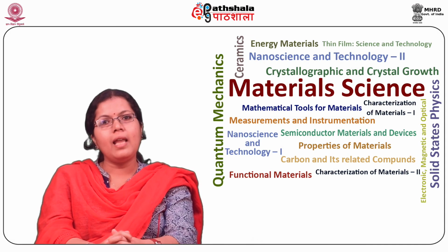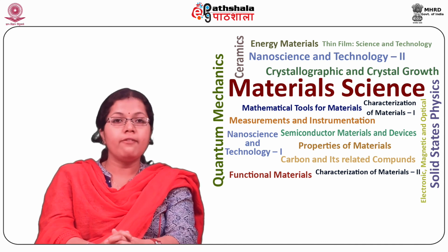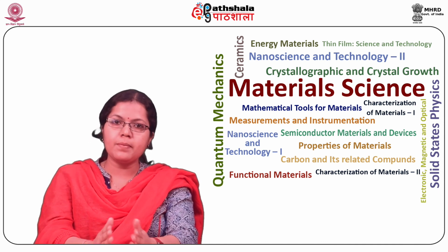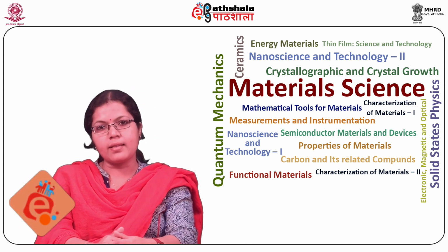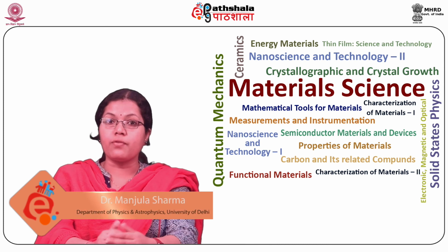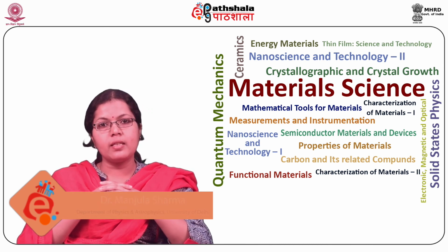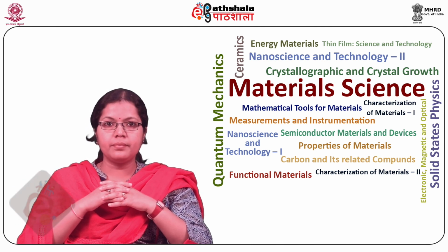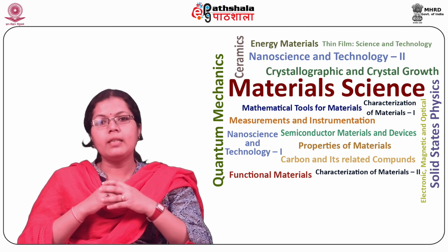So students, let us summarize what we have learned in this module. We have learned about the specimen electron beam interaction, the emission mechanism and characteristics of signals. We learned about the additional signals present in the TEM. Then we learned about the detectors and the common modes of operation of the TEM.